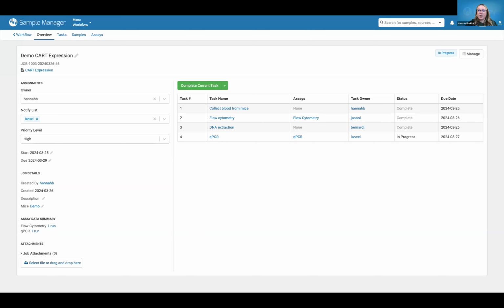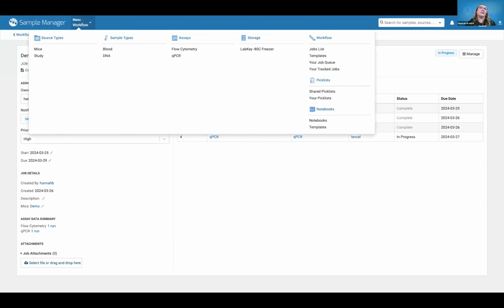I'm just going to make sure I'm peering at Q&A and chat here. Feel free to interrupt me with any questions that you have. What I'd like to actually do is go in and walk through how I did this, right? So it's much easier to see the final product and be like, oh, it's great. It's actually quite easy to formulate these within Sample Manager.